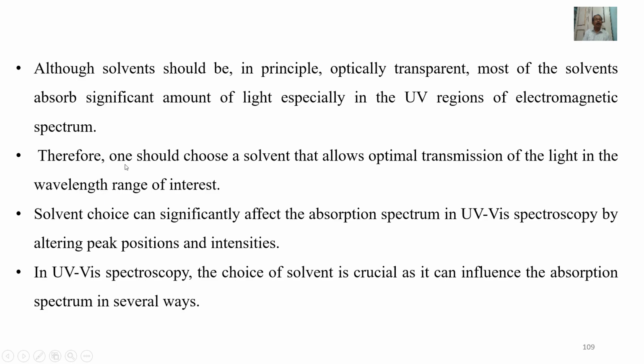Although solvents should in principle be optically transparent, most solvents absorb a significant amount of light, especially in the UV region of the electromagnetic spectrum. Therefore, one should choose a solvent that allows optimal transmission of the light in the wavelength range of interest.